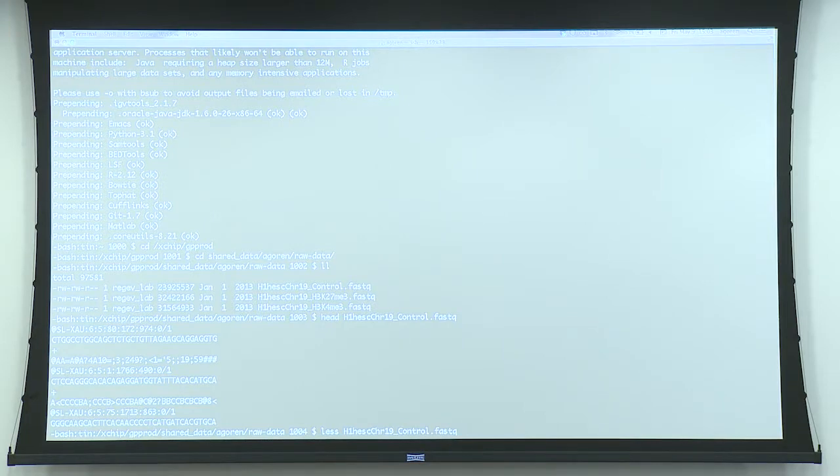Okay, so I want to show you something. If I go to Unix and I look at the original Fastq files, that's how they look. I can enlarge it. This is one of the Fastq files, which, by the end of the day, are just reads. So what I want you to appreciate is that we started from this point where we had a file that looks like that and can go on forever because it's pretty big, even though it's only one chromosome. And then we aligned it to the genome, and now I think most of you, as much as I've seen, managed to view it on IGV. So I think that's already a really good point.